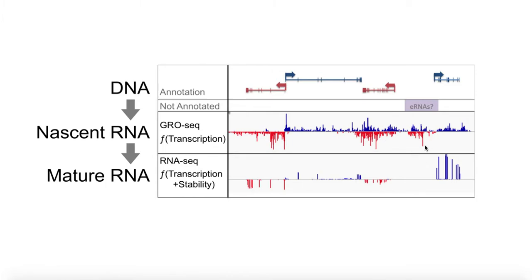The other element that I mentioned in the last slide that you can pick up using nascent is you can pick up these intergenic elements, right? These TREs, transcriptional regulatory elements. That's what we call them. If you knock them out, they appear to have some sort of effect on local transcription. Local is relative.